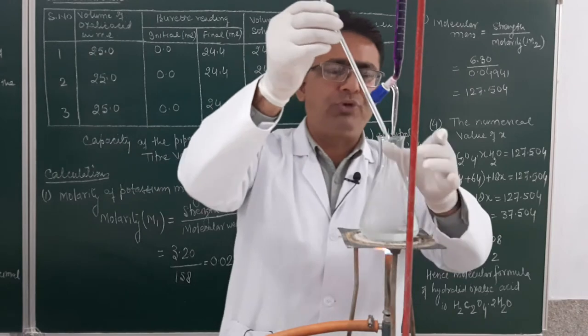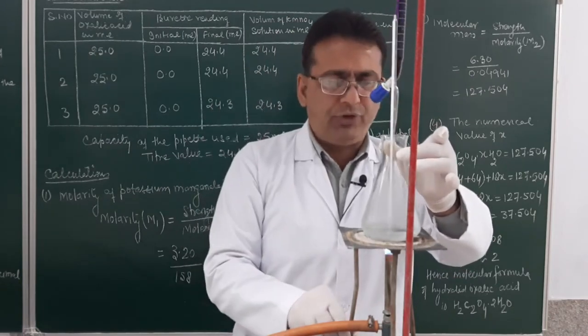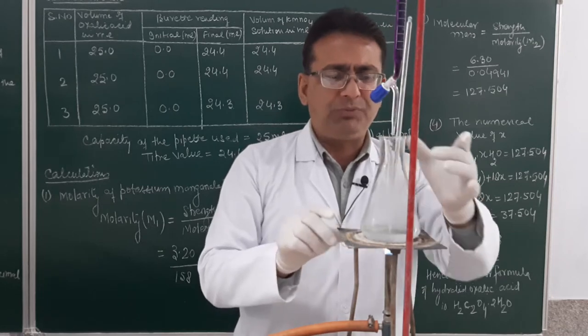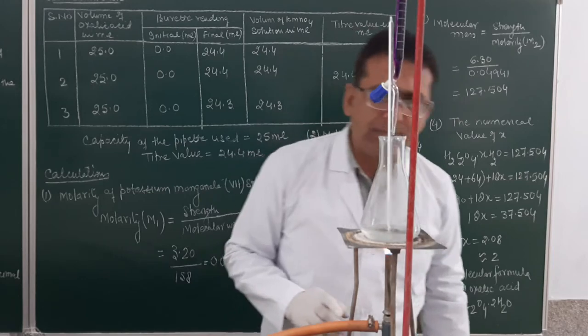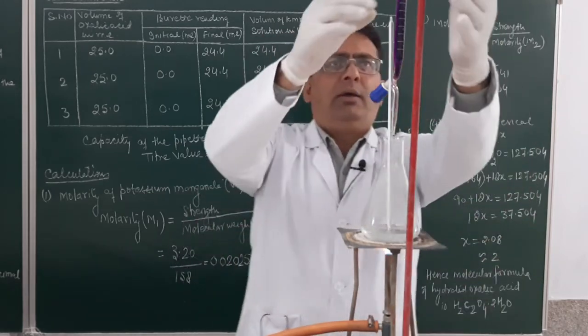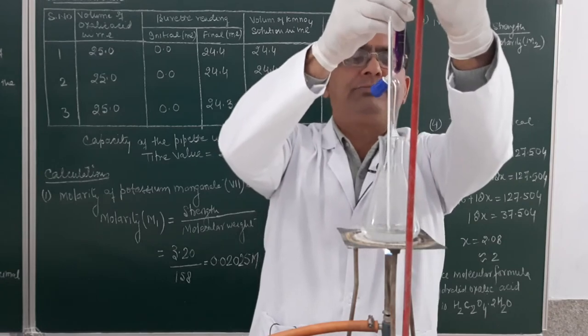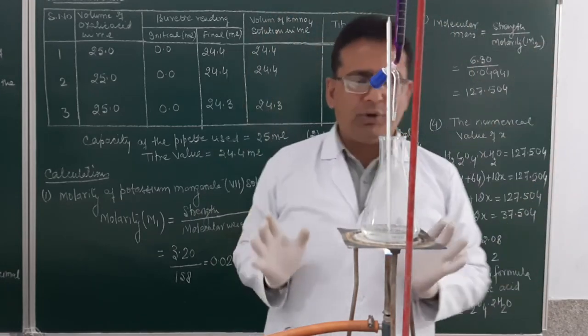And how do we come to know to what temperature it is to be heated? I must ensure that heating must be done till the first bubble appears at the bottom of this. Is it getting clear, student? Till the first bubble appears at the bottom of this.